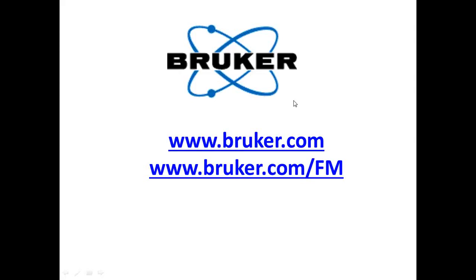Someone's asking, are there classes I can take to get started, or how does one sort of get going in this if they haven't done super resolution before? Oh, okay. Just to get started. Yep. So if they've already done wide field or confocal imaging, it's fairly straightforward. I usually just say, okay, what's the protocol that you're using, and basically just recommend the 2 dyes that I would normally use. And if it's a possibility to use those, then you just go from there and then do the imaging. It is that straightforward, or sometimes it's not, but most of the time it is that straightforward.